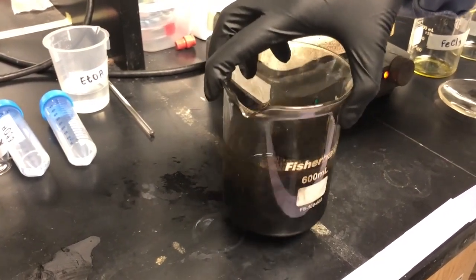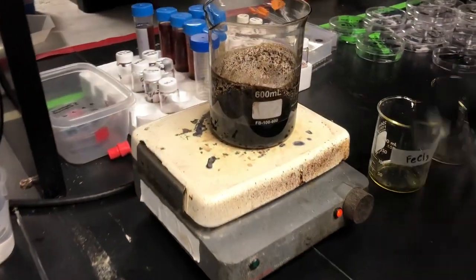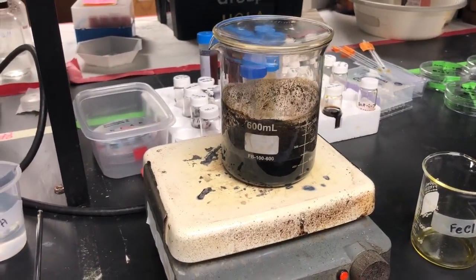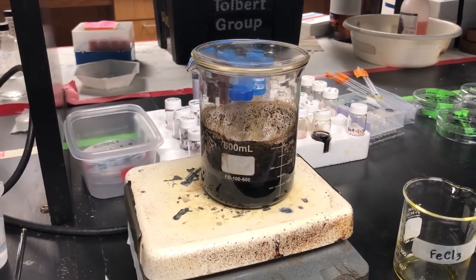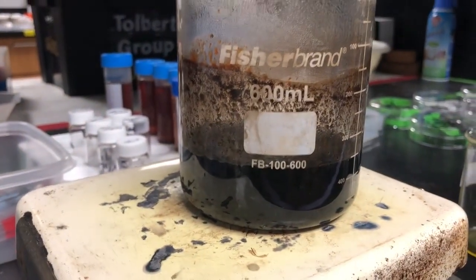Once it's nicely combined, we'll begin heating and throw the watch glass on top so that the ammonium hydroxide fumes don't vent out excessively. So we're going to let this heat without stirring until it begins to boil. That's going to take about 4 to 5 minutes, and so we'll come back to the video once this is complete. Okay, and we're back.